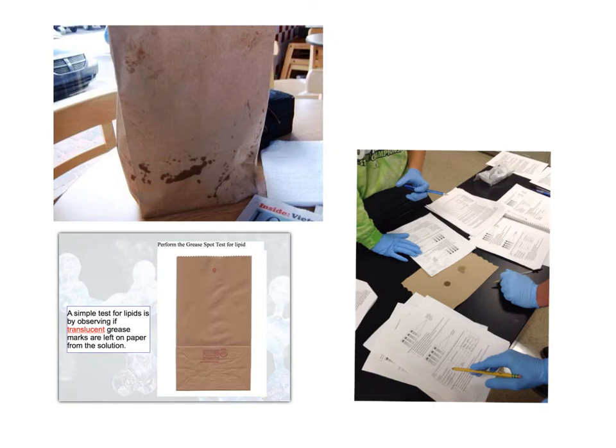Okay, so the very last test that you are going to test for is a test for fats or lipids. So lipids are not polymers. They actually include a variety of molecules such as fats, oils, waxes, steroids. And so what we're going to test for in this test is for your typical fat or oil.